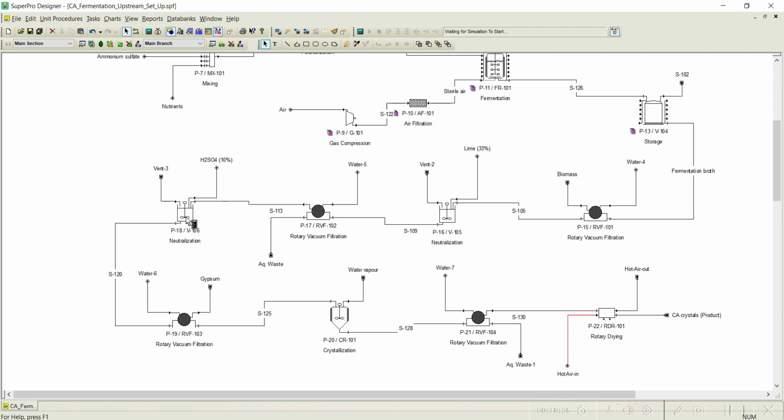Since both calcium citrate and gypsum are newly registered compounds, we went with some default properties of already existing compounds, so their molecular weights are not proper when you set up the stoichiometric equation. If you don't add the proper molecular weight for calcium citrate and gypsum, later you are going to face an error, or an imbalance will take place between the reactants and the product. That is the reason we need to set up the molecular weight.